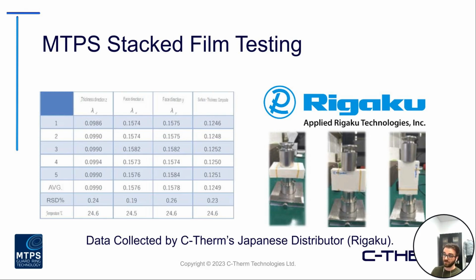And the other thing you can do, if you have enough of these layers stacked up, is rotate those samples around, as we can see with the different orientations that were tested. Based on the positioning of the sample on top of the sensor, you can control the direction of your measurement. That heat pulse is always, you can imagine, traveling up from the sensor into that test sample, as a straight line going up. So if you rotate the sample itself, you're changing the direction of what's being measured in that material.